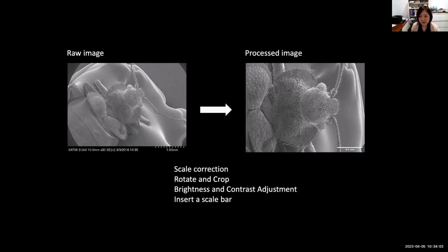So I'm going to stop sharing. And this time, I will screen share ImageJ.